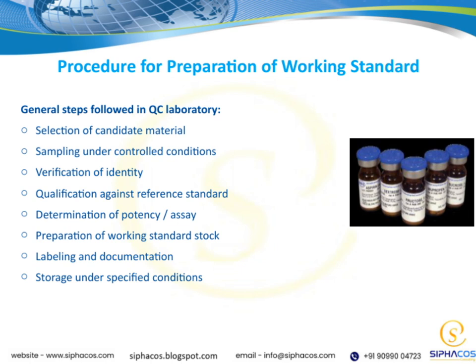Then, we qualify the candidate against a reference standard. Essentially, we compare it to an already established standard to ensure consistency and accuracy. This step helps us validate that our candidate material meets the necessary specifications.